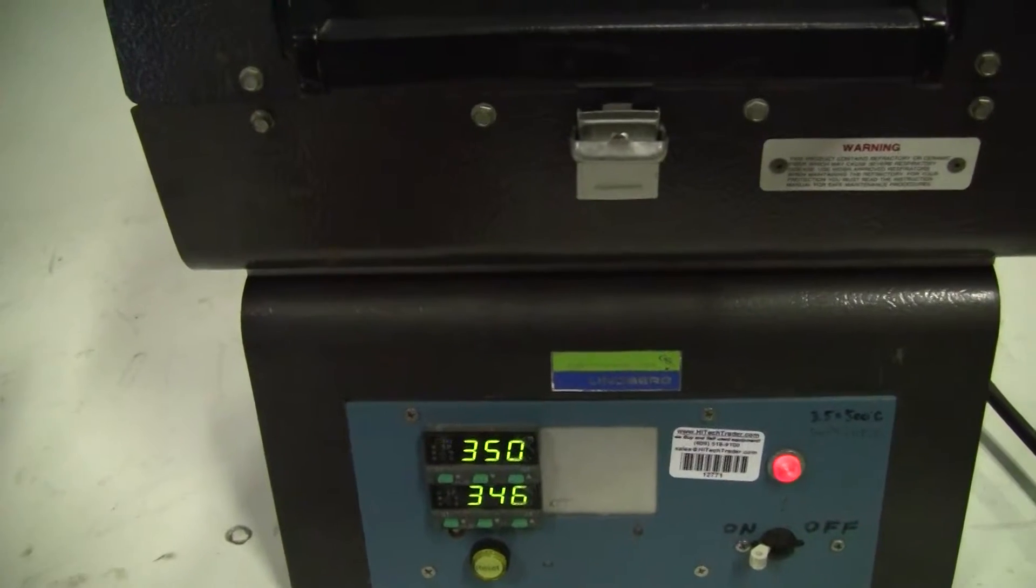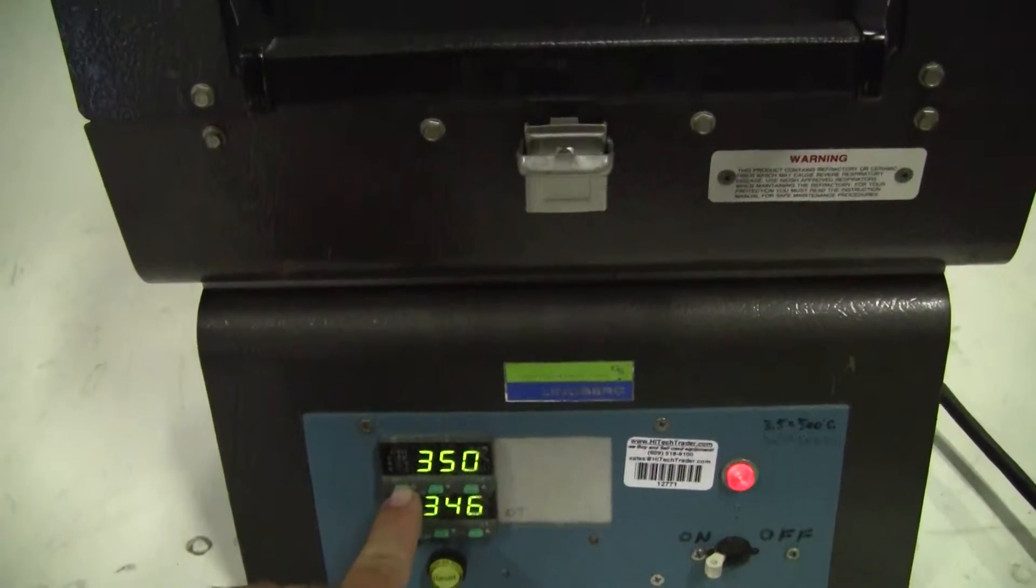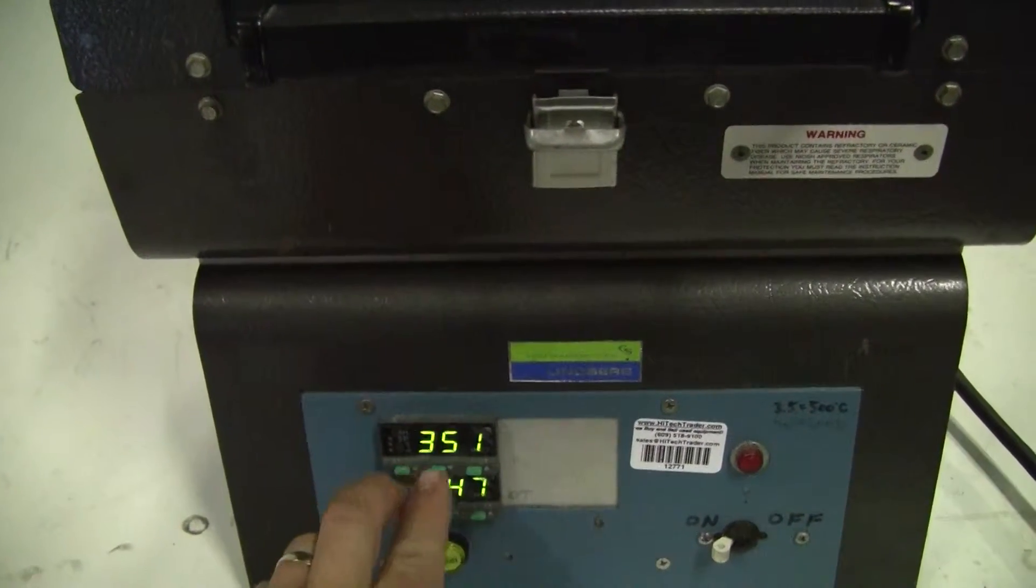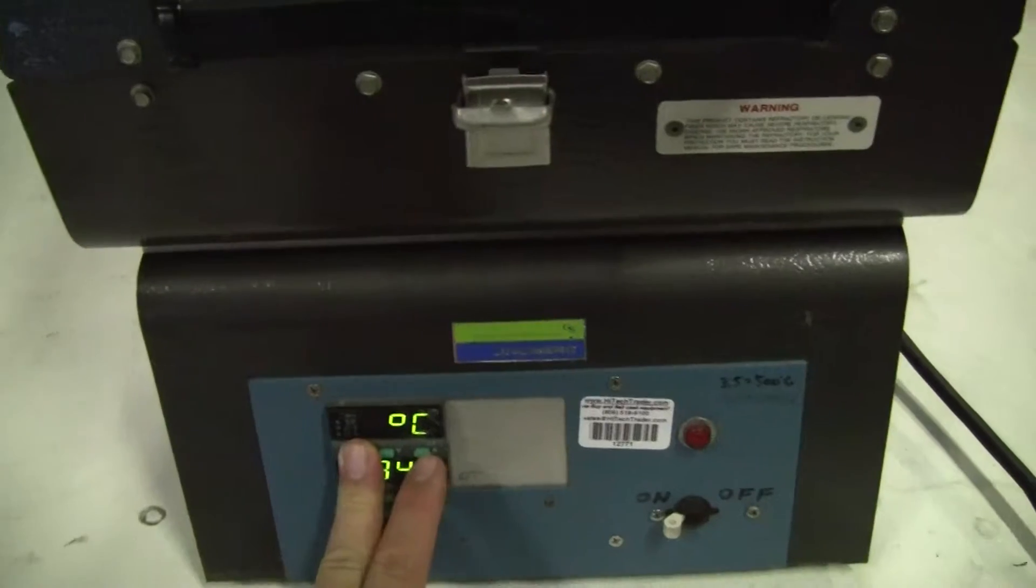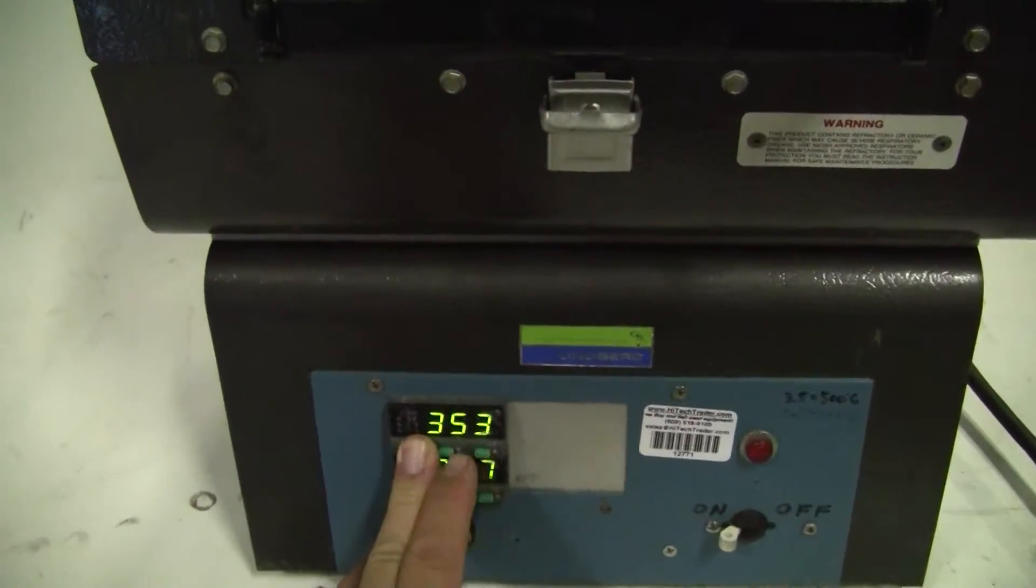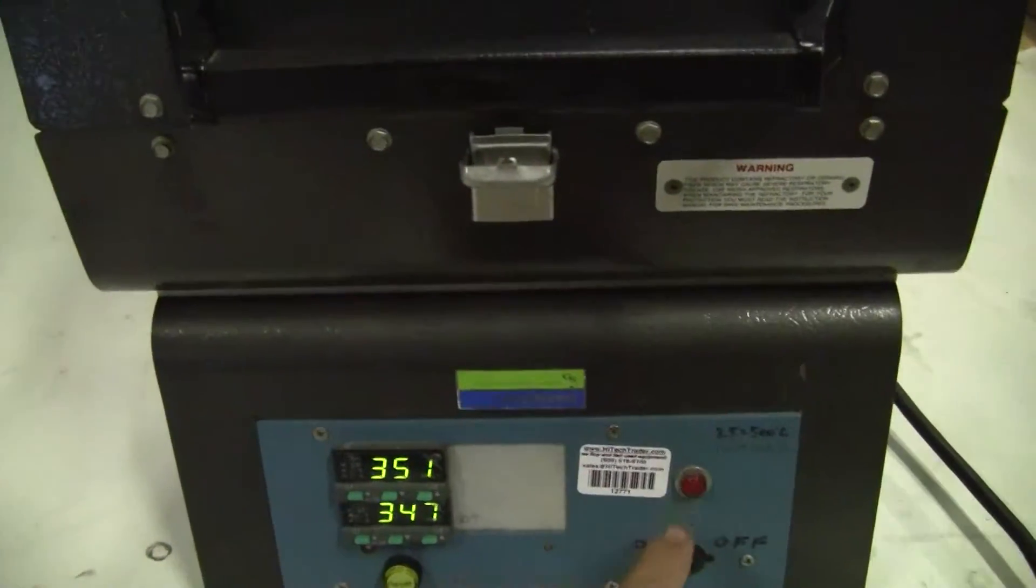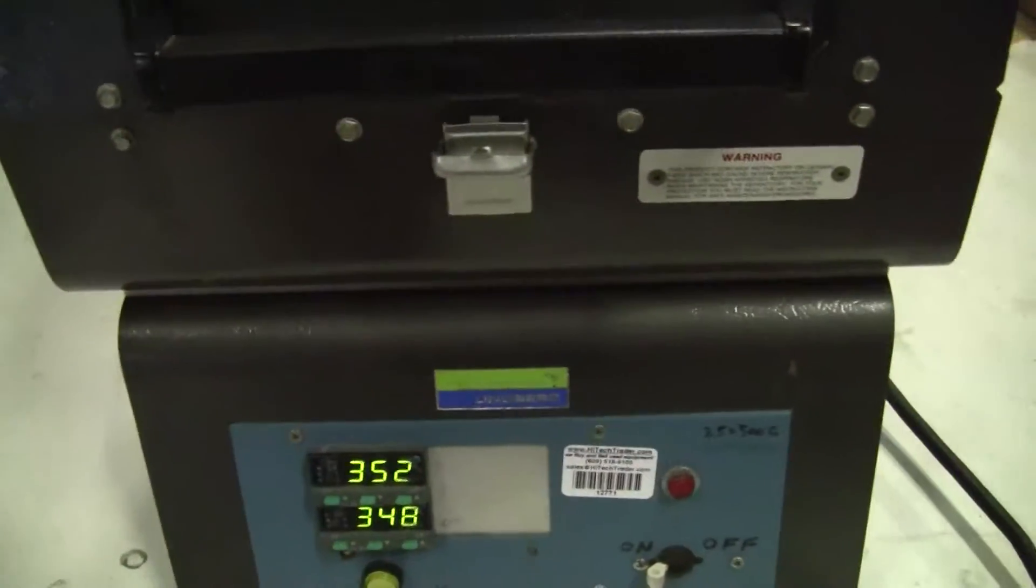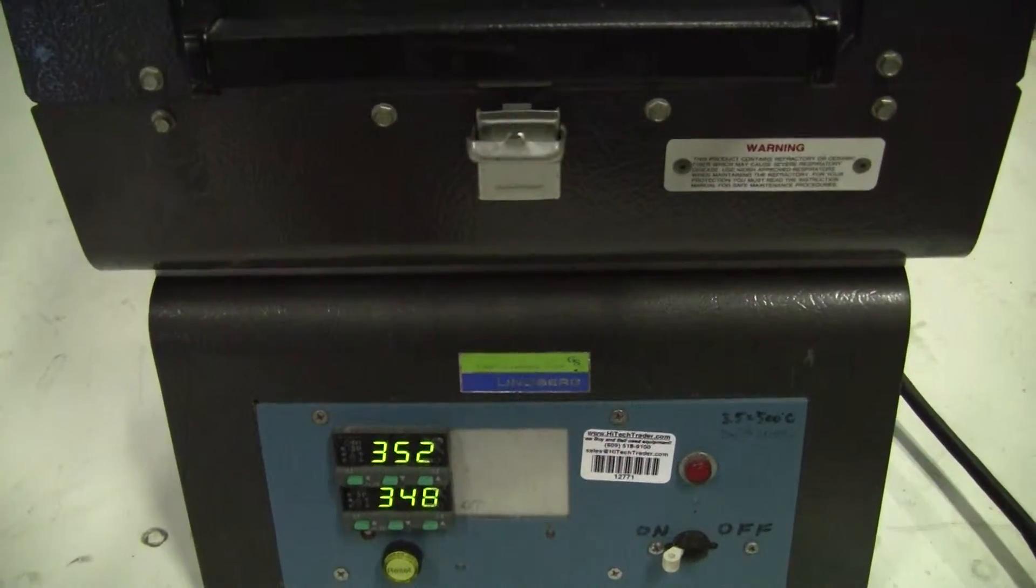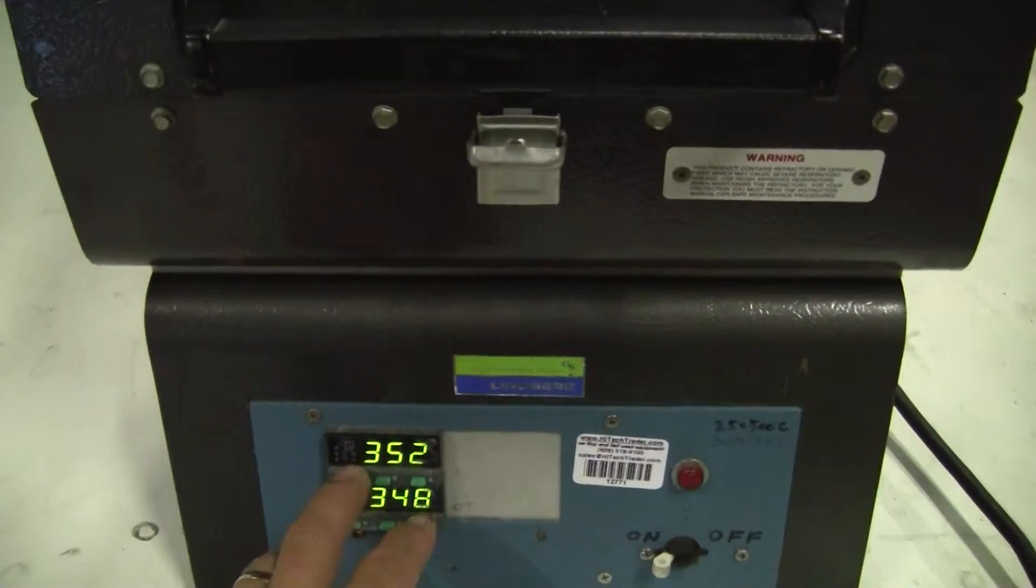You set both the primary and the over temp separately by getting a set point and then hitting the up or down button. The red light is flashing when it's calling for heat. So it's not calling for heat now because it's just about at temperature.